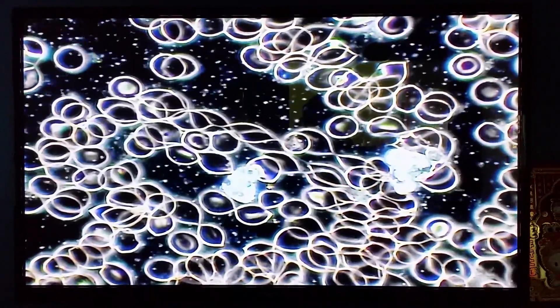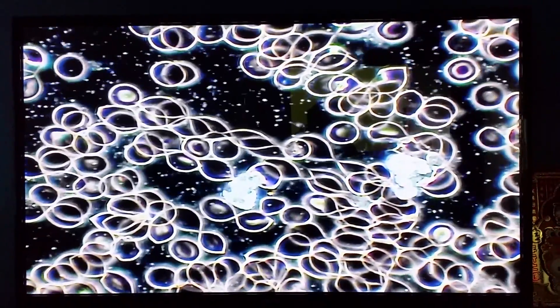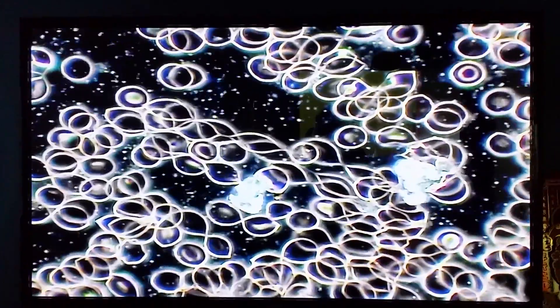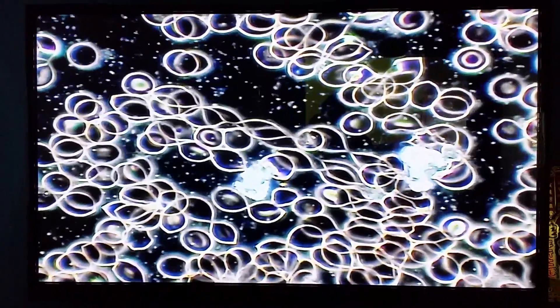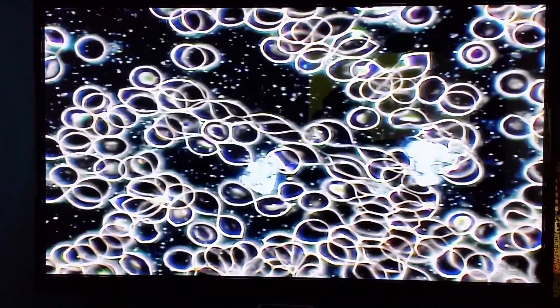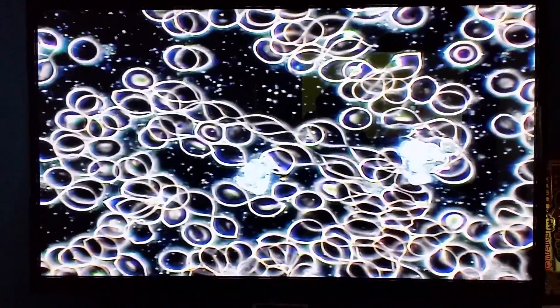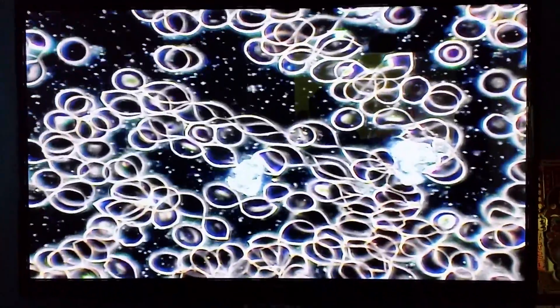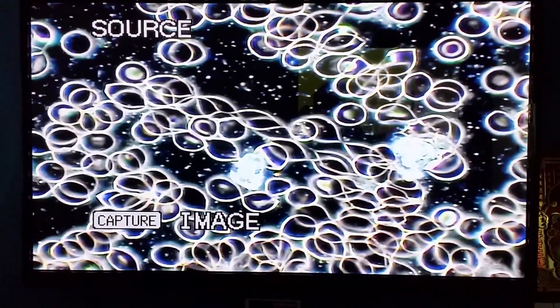These of different shapes and sizes, those are platelets. We need platelets so that when we are wounded, the bleeding will stop. But too much of this, or giant platelet, is an indication of inflammation.